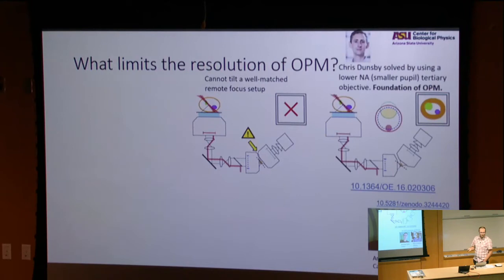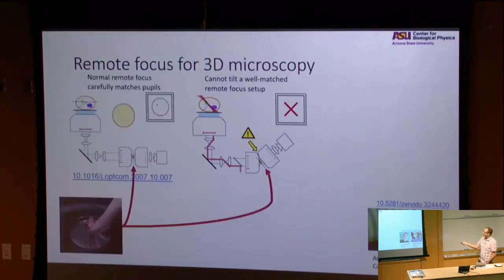But aren't you canceling the aberrations by putting them back to back? You are. In a coaxial way? Yeah, so if you tilt them, then you won't cancel the spherical aberration. So if you tilt this one, it doesn't matter, because you can look at this in any way you want. Remember, you're imaging whatever happens to be here, and that satisfies both sine and Herschel, so there are no aberrations in what lives here. It doesn't matter what you do with the third microscope. That's the beauty of this method.